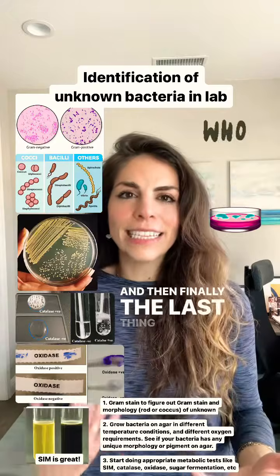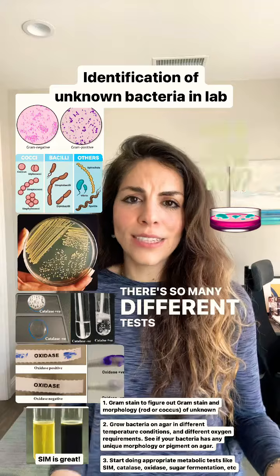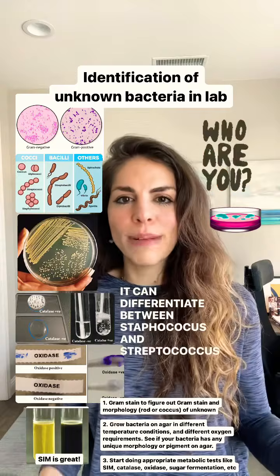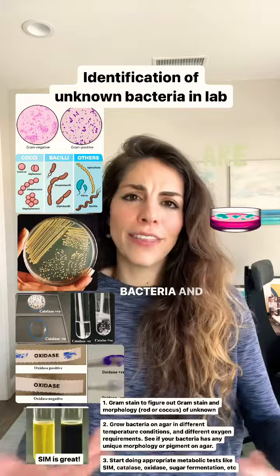And then finally, the last thing I would do is biochemical tests, metabolic tests. There's so many different tests, so you'd have to narrow it down. But a good test is catalase test. It can differentiate between Staphylococcus and Streptococcus bacteria. You can do an oxidase test to differentiate gram-negative bacteria, and there's so many more.